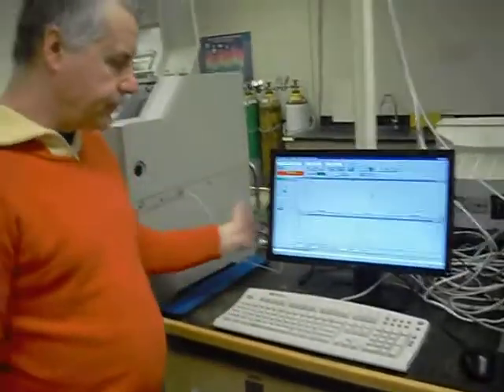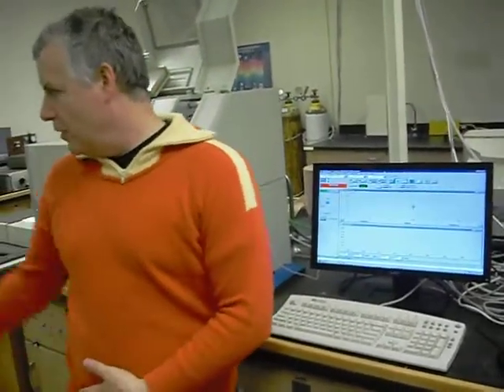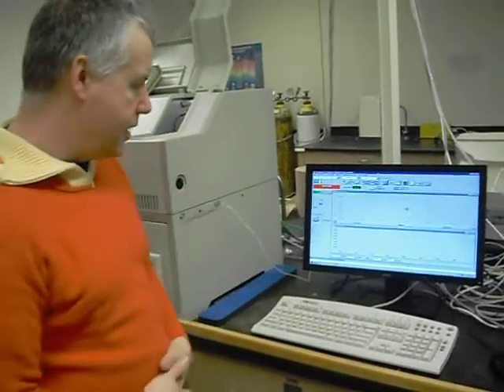Okay? Cool. So I know you guys can't see. If you want to come on this side, that's cool.